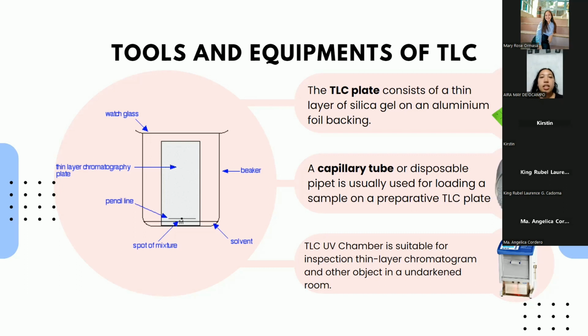The last one is the TLC sample recovery tubes. This is like a pencil-like device used for the recovery of samples from a developed TLC plate by vacuum. Next.